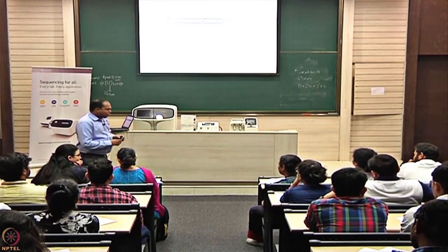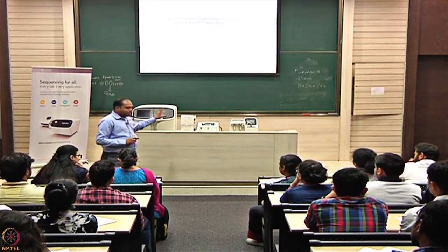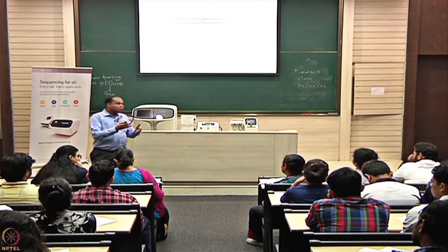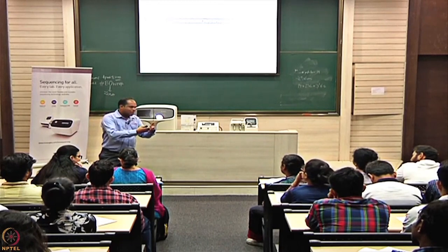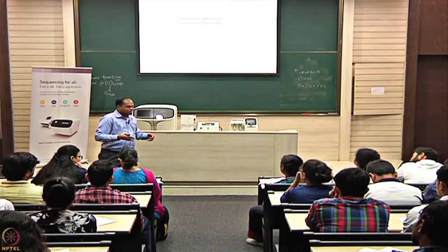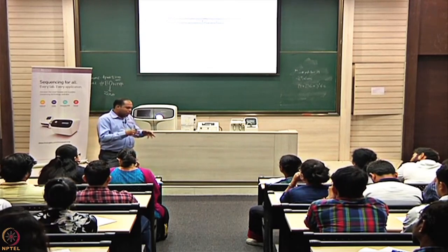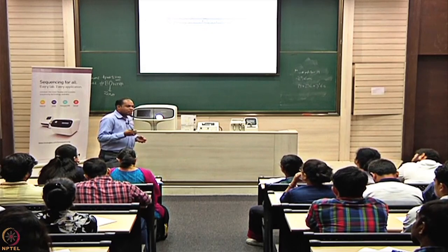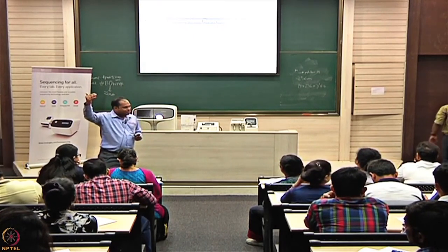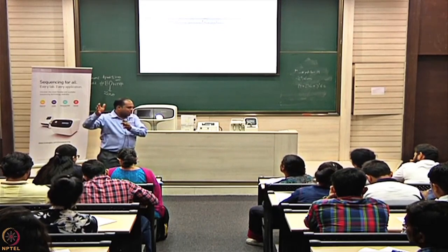Do you have to work on the cloud first? No, nothing like that. The data gets generated on the S5 system or the instrument. Once the data is generated, you do the basic analysis at the system level itself. We have a server with this which helps you do the basic analysis, like aligning the data to the reference genome, then looking at the coverage analysis, and then coming to the variant level where you get all the variants. So you have got the variants through the system itself. Variants would be all the mutations that you are looking for. Now, these mutations or variants that you are getting, we need to annotate them, or we need to know more about them. So we have a tool which is cloud based, on a website. We take this data, upload it onto the cloud, and do the analysis.